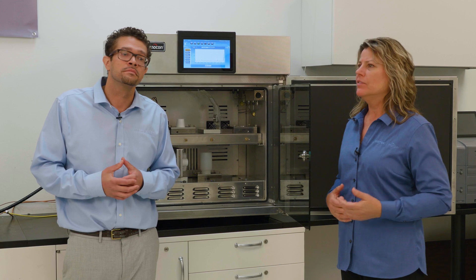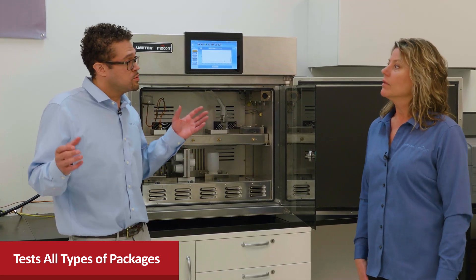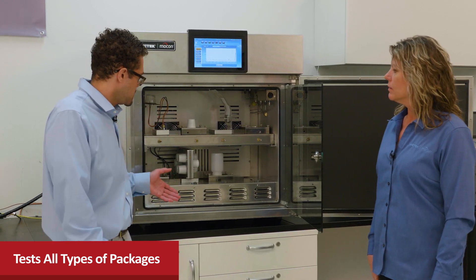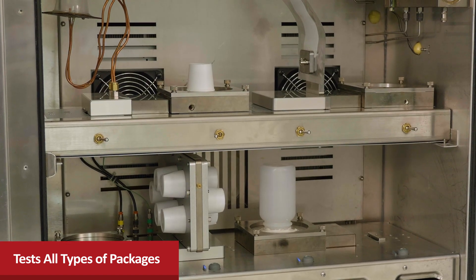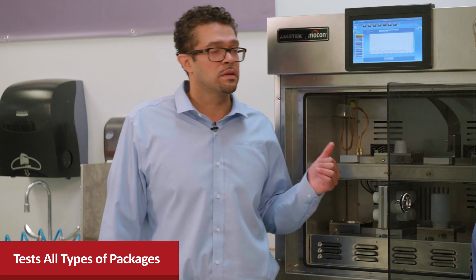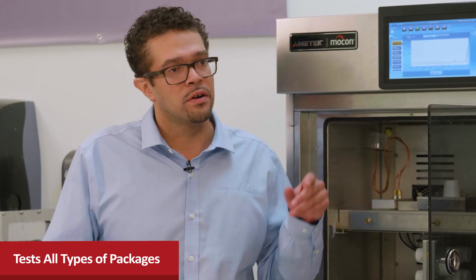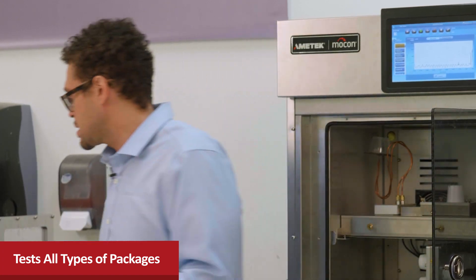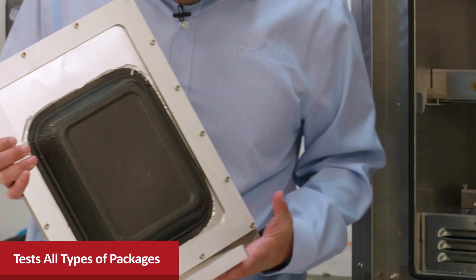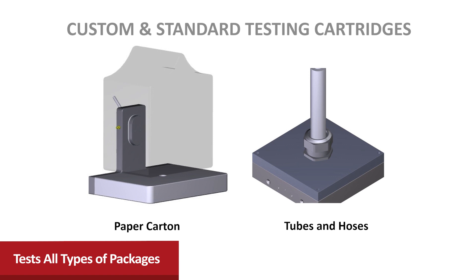This instrument can test any package that does not have any element of porosity, because if you have any element of porosity, the two gases intermix and you'll get erroneous data. From the volume here, you can see it's quite large — you have the capability to test four three-liter bottles in here. What's great about this instrument is that we can test packaging systems that were very hard to obtain meaningful data on in the past — for instance, O-rings, paper cartons, very large trays. This fixture here is a very large tray, which is difficult to test because it's hard enough to find a plate big enough. Another great feature is that we have the capability to create specialized testing cartridges, so if you have a very unique application, you can work with our engineering team to design a cartridge specific to your application.